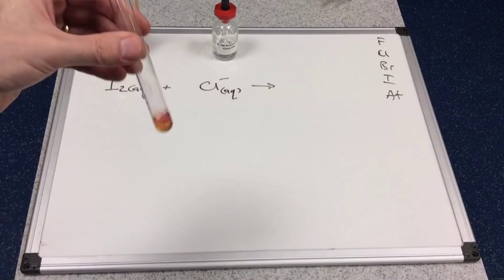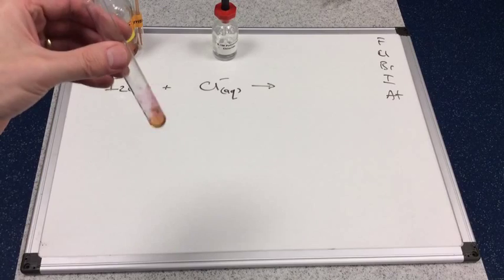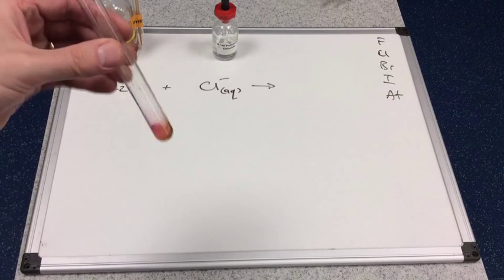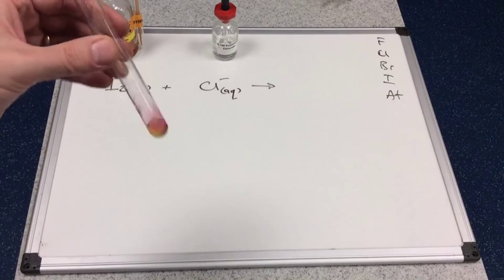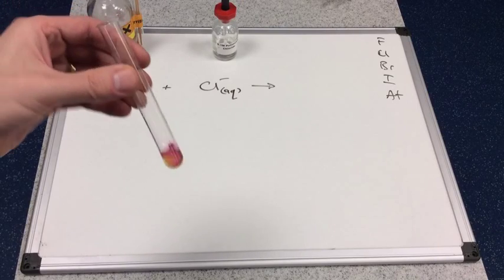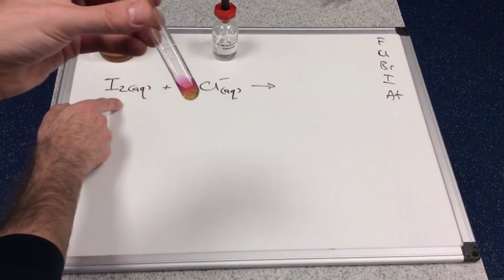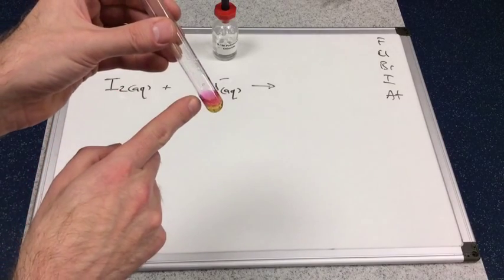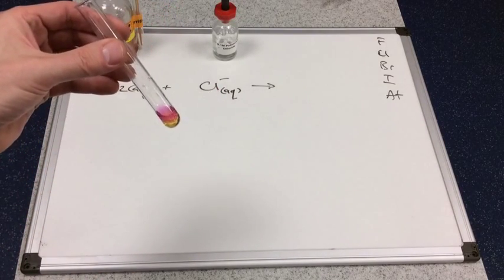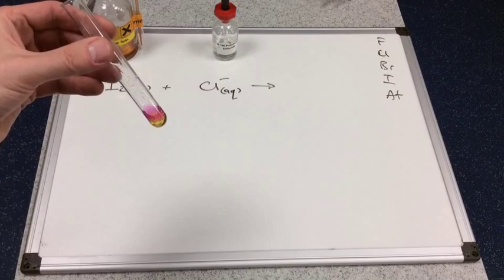And hopefully you can see the purple color is appearing, which is confirmation that we've got iodine, I2, in that test tube. We started with I2, we've still got I2, and so therefore there's been no reaction.